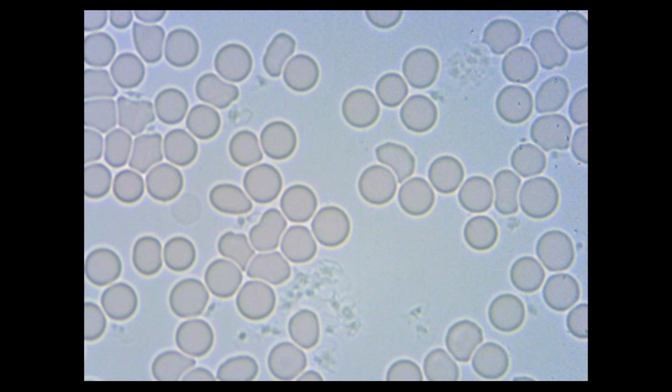And then lastly, even if you're not really planning on using pleomorphism, I still believe it's quite important to be able to see the various pleomorphic growth forms because they tell us so much about the state of the terrain. I've seen many clients where the normal live blood anomalies were not all that unusual, but a high number of advanced pleomorphic growth forms were seen, which then indicates that the treatment of the case needs to be more focused and specific to improving the terrain, and that progress in these cases will tend to be slower because of the length of time that the terrain has been compromised for.